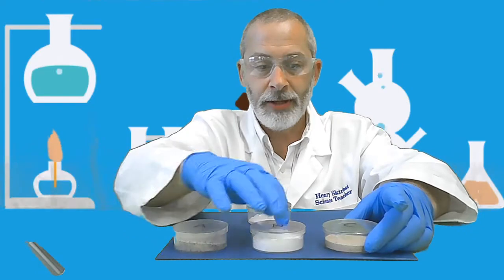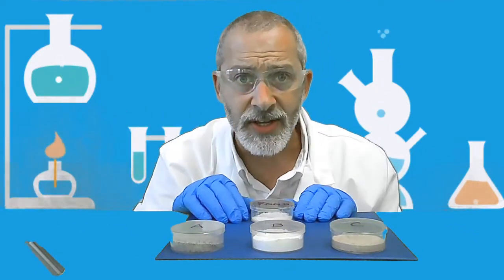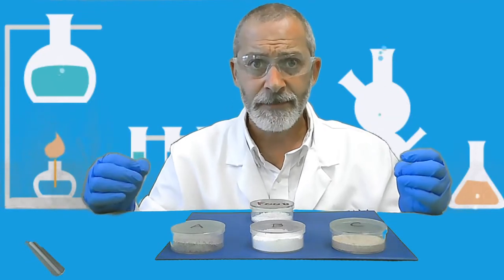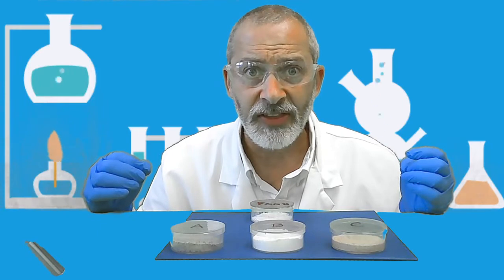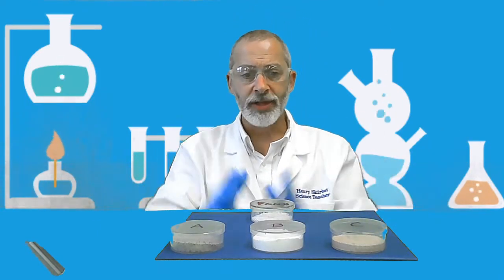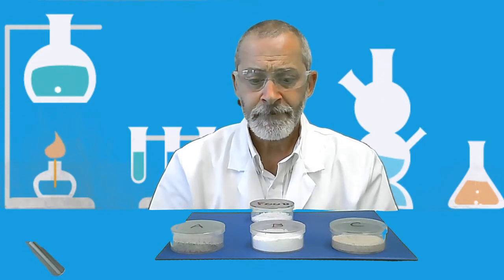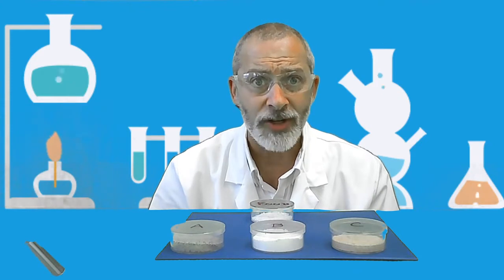So there's sampling locations A, B, and C, and NASA has asked us to test these 3 soil samples for any evidence of microorganisms, living things from Mars. Now, in order to do this, we're going to modify our lab procedures just a tad, and we're going to apply those procedures to our experiment.